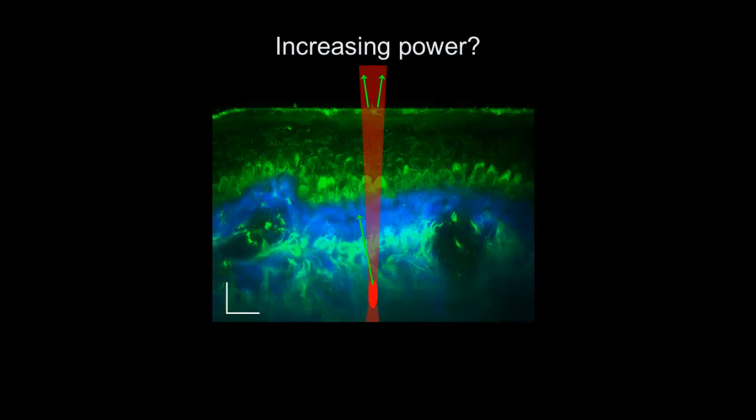Just because you have to crank up the power so much, you have enough photons to induce two-photon fluorescence even for the unfocused beam. So you get contributions a lot from this area that adds up to the photons here, and it seems as if you have a lot of green here, but actually part of the green comes from the area here. All right? It has nothing to do with here, and it's there all the time. Wherever you go with this beam, there will always be surface, and so you get an overall haze that overlays your image. And your signal to noise is going to be very bad.